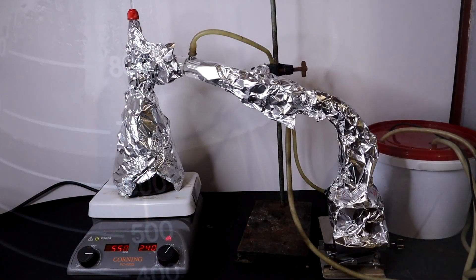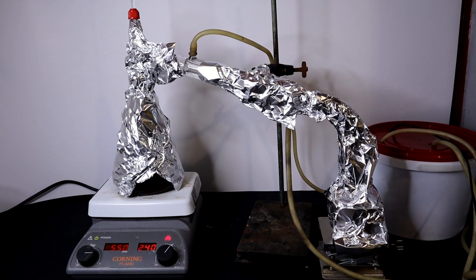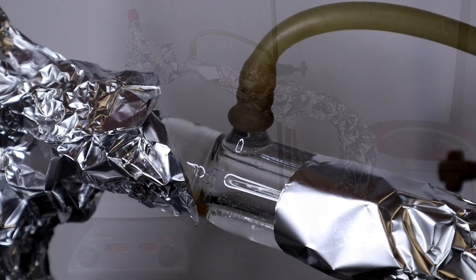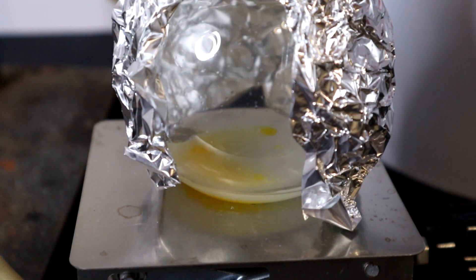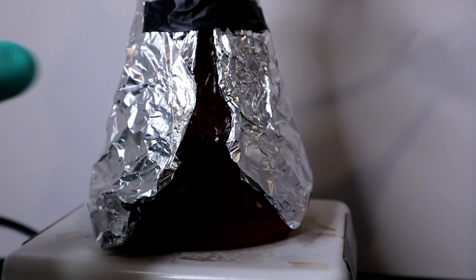After which it was set up for distillation. As aniline is light sensitive I've wrapped the flask, condenser and collecting flask with aluminum foil. Slowly a milky white liquid and a yellow liquid started collecting in the flask. Distillation was continued until the distillate became clear.